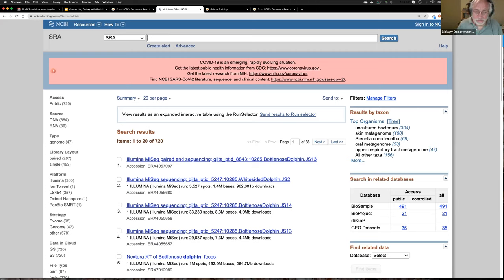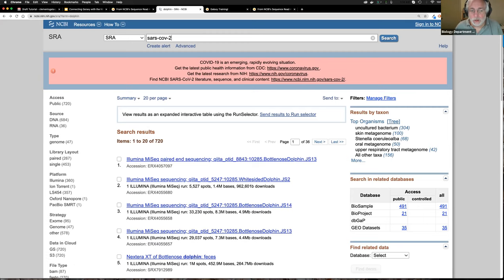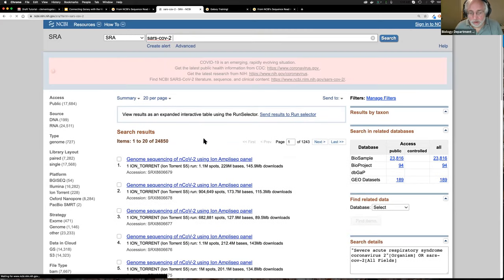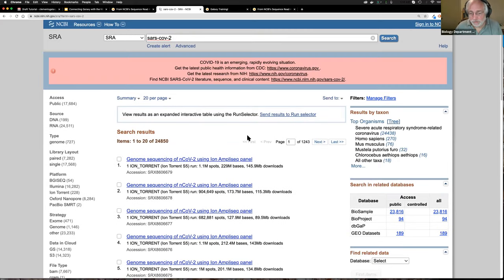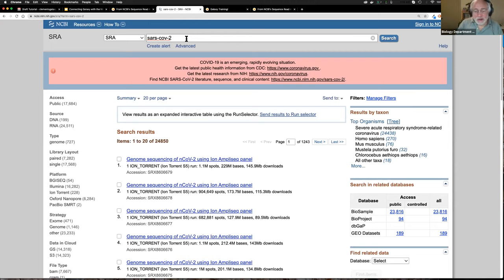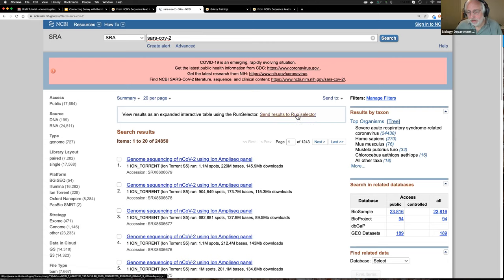We're going to search for SARS-CoV-2 — and now we have 25,000 entries, on page 1 of 1,200 pages. That's a lot of data. We could narrow things down further — by country like Egypt or Thailand — but what I want to do is switch to the Run Selector interface, which is a lot friendlier. I'm going to send all 25,000 to the Run Selector by clicking 'Send results to Run Selector.'